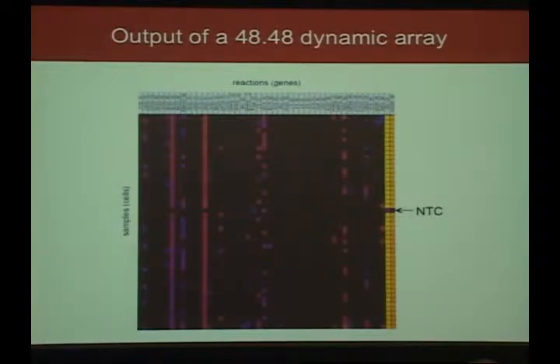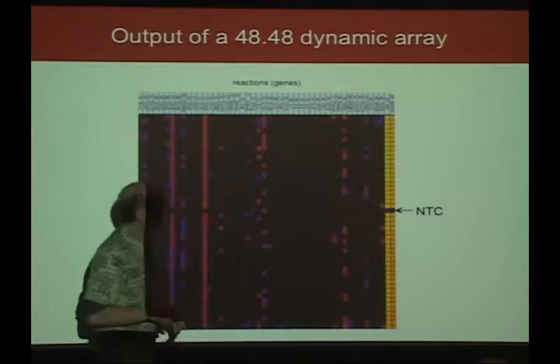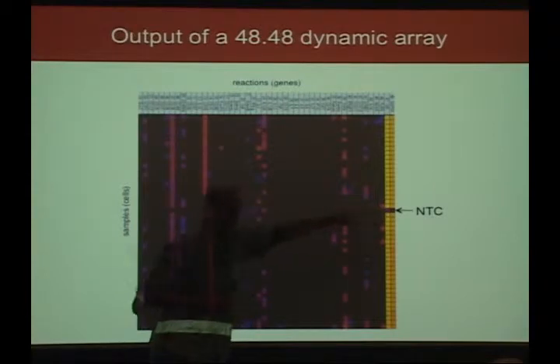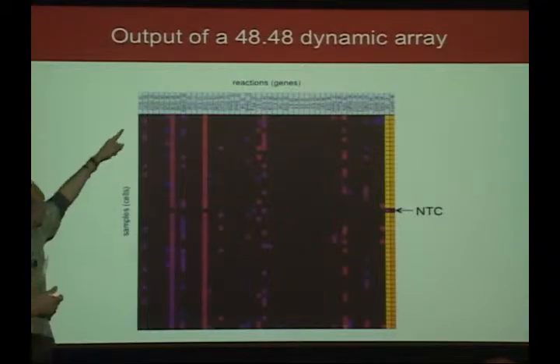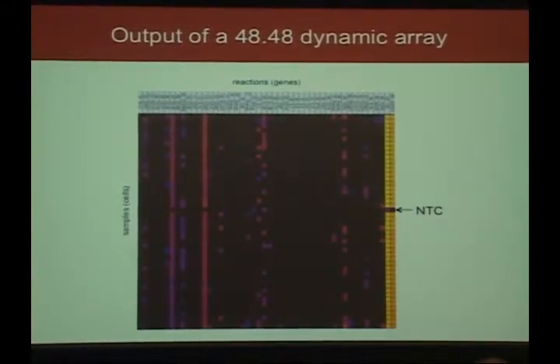In this particular example, there's a relative paucity of the genes we're looking at that are actually expressed in these cells, although you can see there's a couple of genes, and these are the positive controls over here, which are always expressed. I should point out that the gap here is the no template control, so that's supposed to be blank. And then there are other genes that you can see are heterogeneously expressed. Again, that's the kind of information you get out of this system doing single cell qPCR that you wouldn't get at the level of a bulk population of cell RNAs.